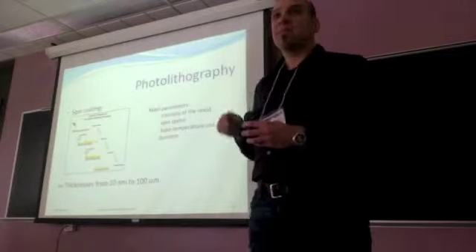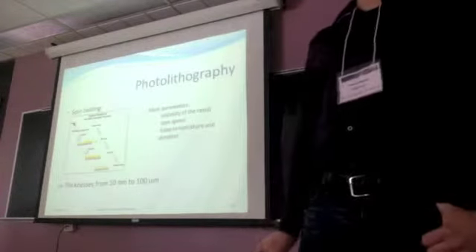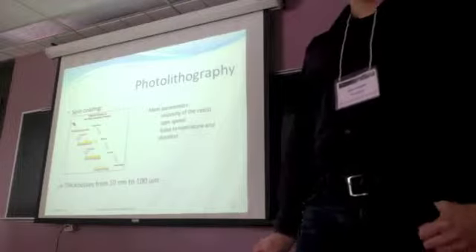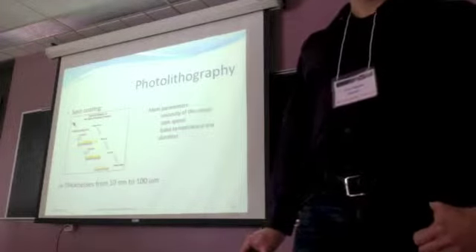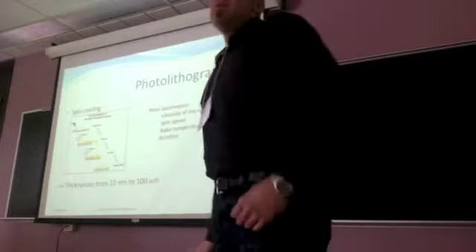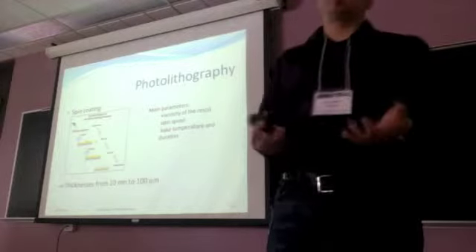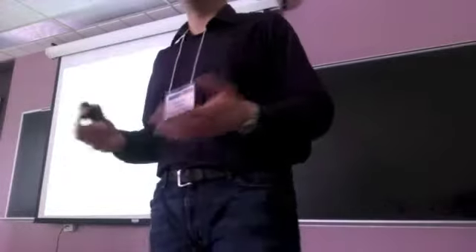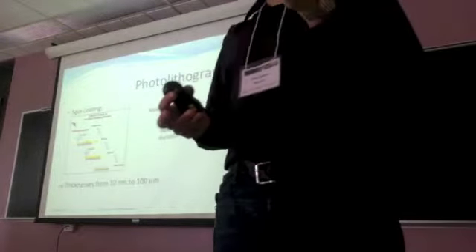How much thicker is it, and how wide is that? It depends. It depends on a lot of parameters. It depends on the viscosity of the resist. It depends on the spin speed. But it can be twice. But the middle isn't usually? No, the middle, no. It depends also on the size. So if you use a wafer, for sure it will be very uniform. But if you use a very small sample, it will be very hard to get a uniform thickness.